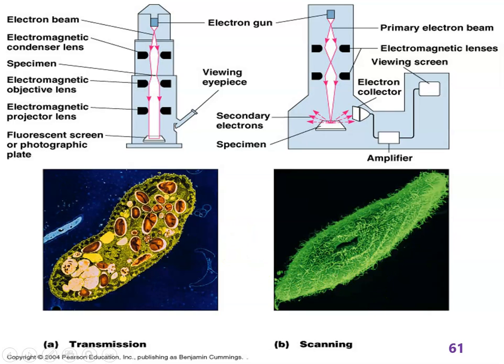And that's it for microscopy. That's all you need to know about microscopy. Be able to tell me the differences between the 4 types of light microscopy, the 2 types of electron microscopy, and be able to tell me what would happen in light microscopy if you used a 100x objective without oil. And that's enough for this one long video.